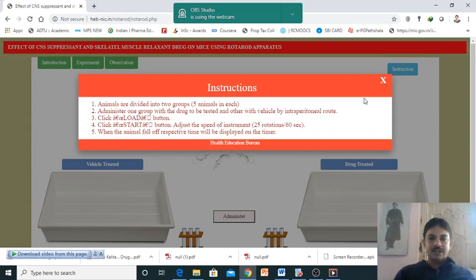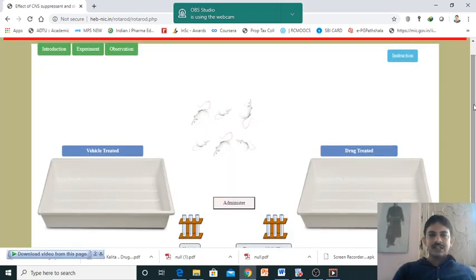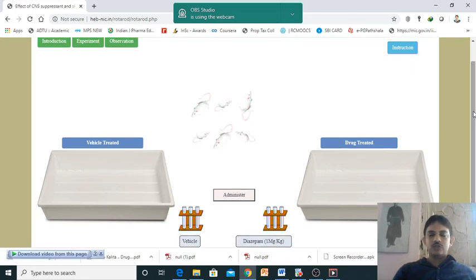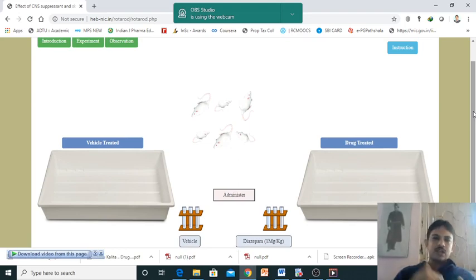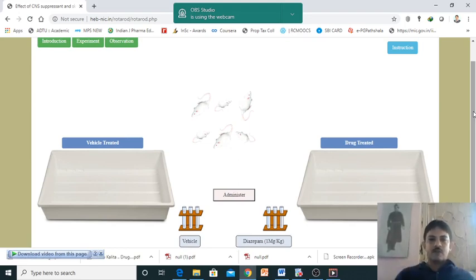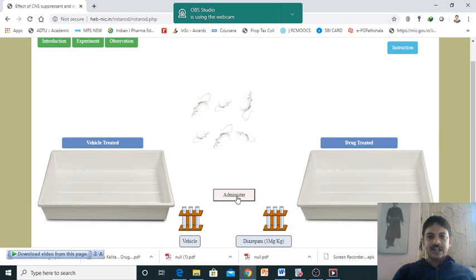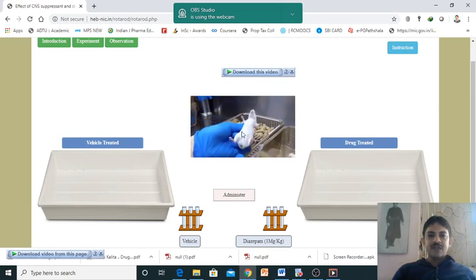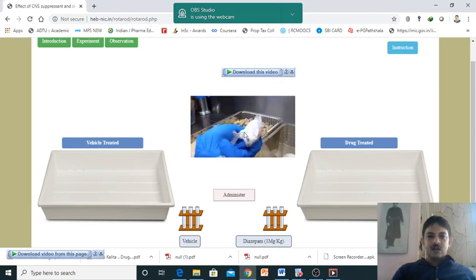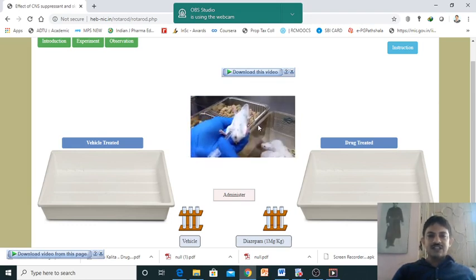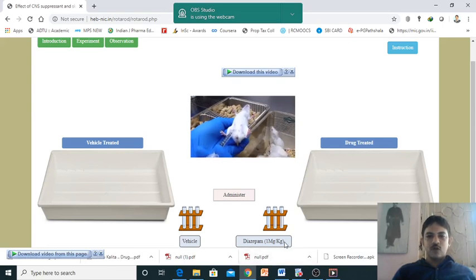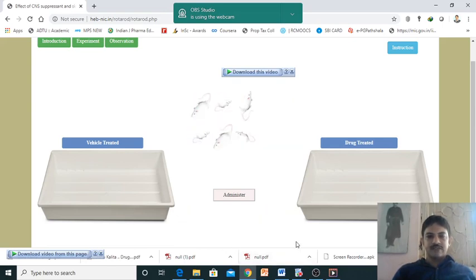Doing the experiment is very simple - you just need to know the mechanism and how we are performing the experiment. Click here: one is vehicle treated, the other is drug treated. Just click administer and the vehicle or drug is injected through the intraperitoneal mode. Diazepam 1 mg per kg is the dose they have selected.